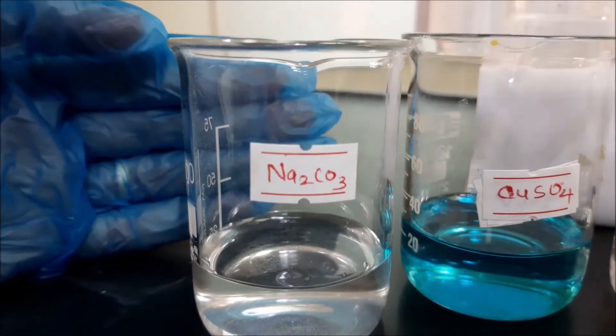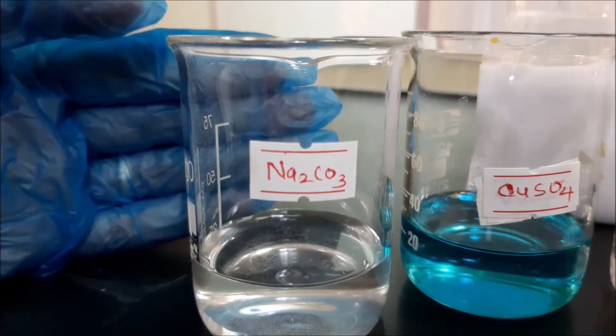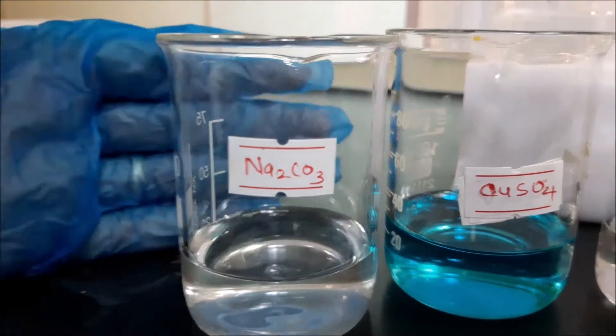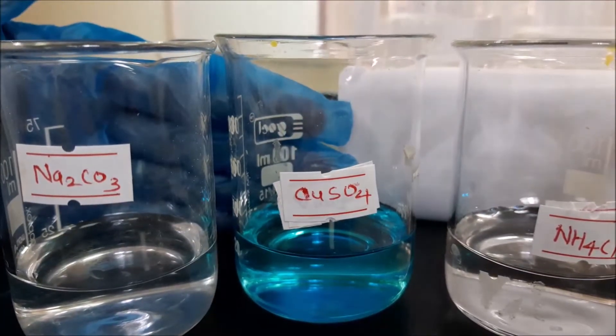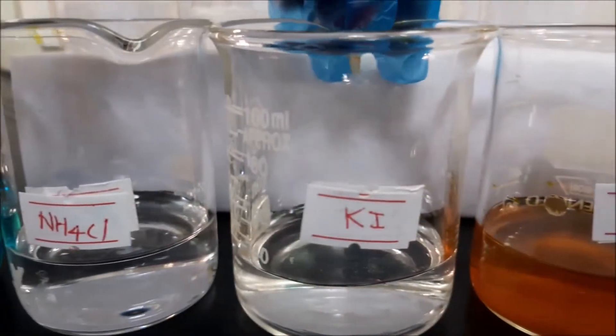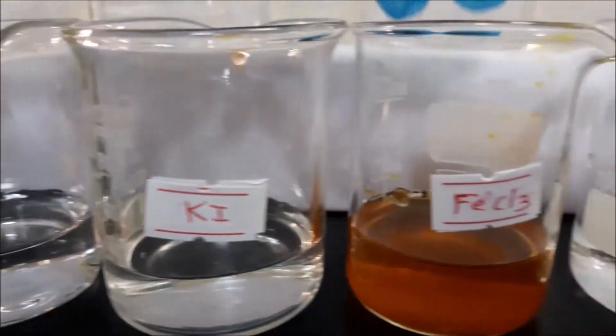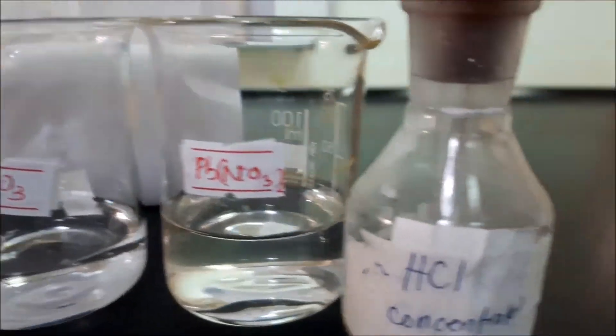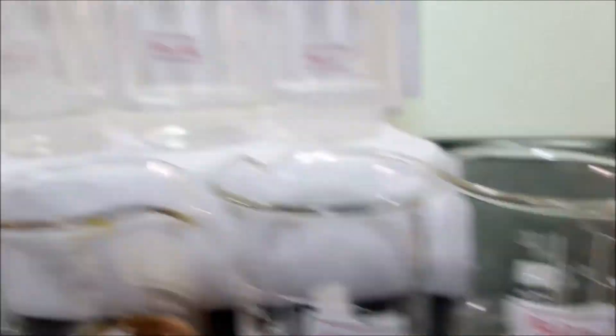The chemicals that we will need in this experiment are sodium carbonate, copper sulfate, ammonium chloride, potassium iodide, iron chloride, potassium nitrate, lead nitrate, and hydrochloric acid.